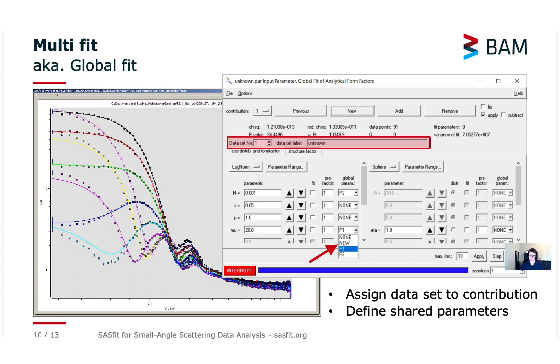This option for global fitting also provides some kind of global parameters within the model setups and this way you can share variables between different models. For example they can share the same contrast value or you can even fit a certain shared parameter which exists in multiple models. As you can see this can get really complex quickly but this is also some kind of versatility the SASFIT program provides.